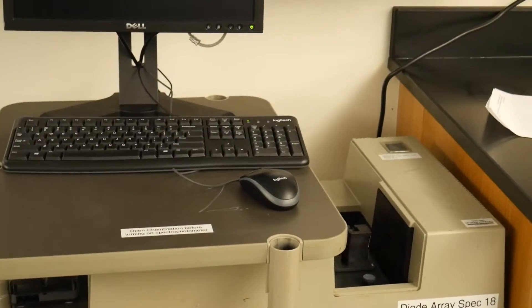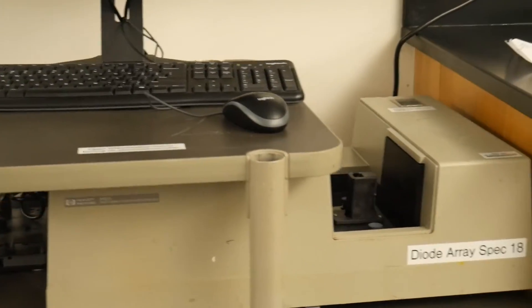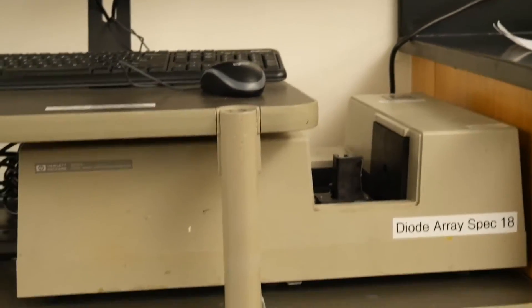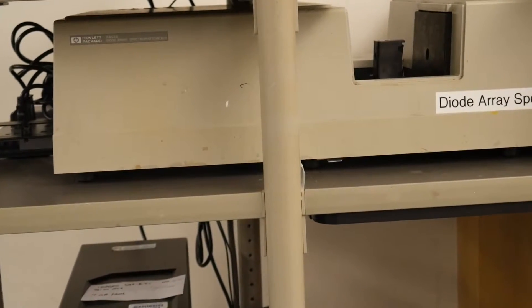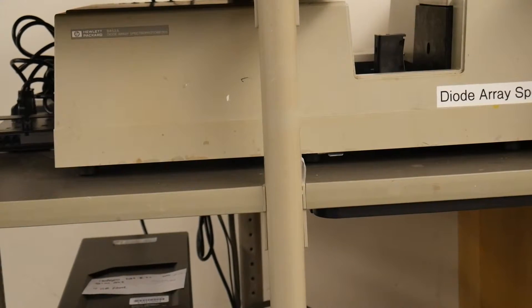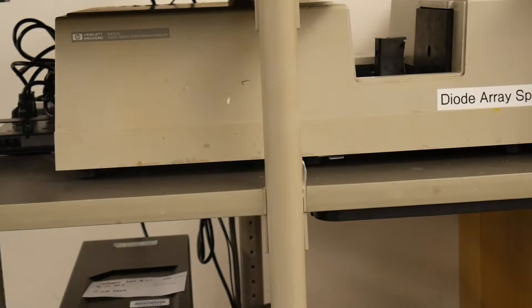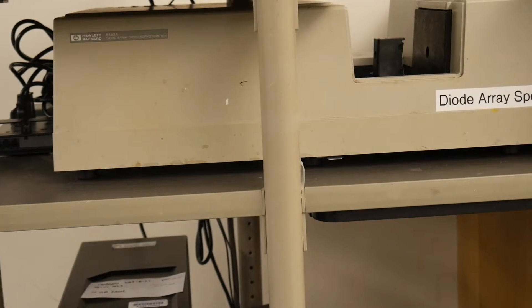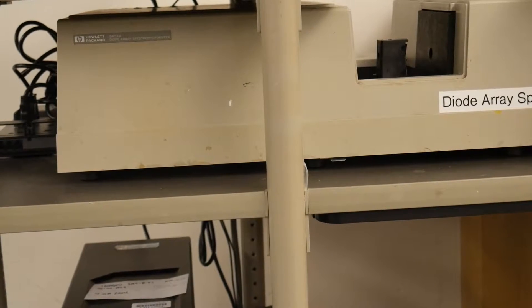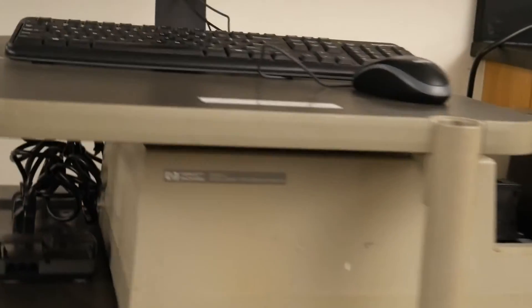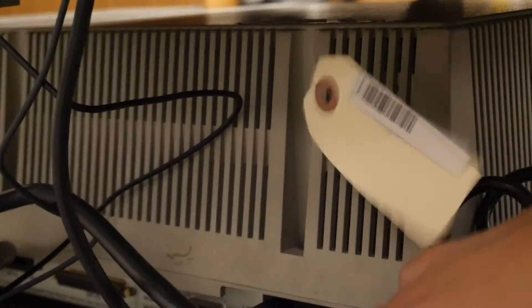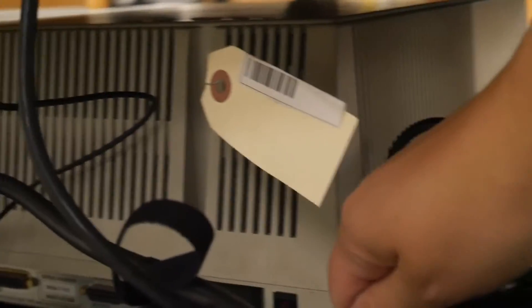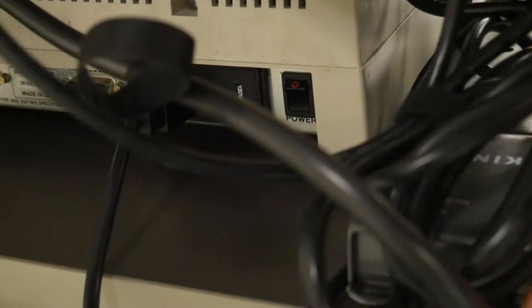So this is what our older models look like. And these are a little different in that they don't have the buttons on the front for the blank or the sample, so you're going to have to do that all in software. And then the other thing that's different about them is the power button is a little harder to find. So I'm just going to pull this out and you can see the power button right here next to the power cord.